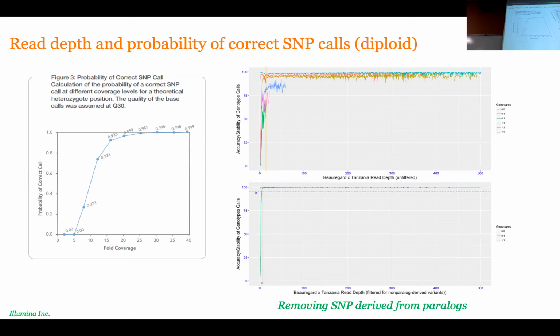As you can see at the top there, you do see quite a bit of noise. That's a diploid. As you approach somewhere here, about 15 or 20, it's sort of comparable if you compare between this and that.